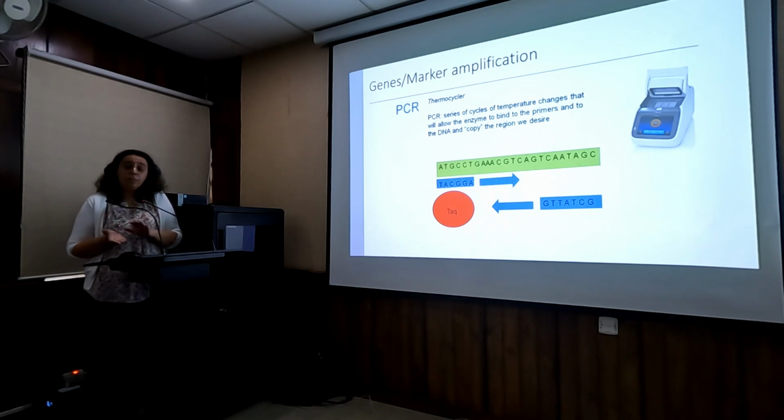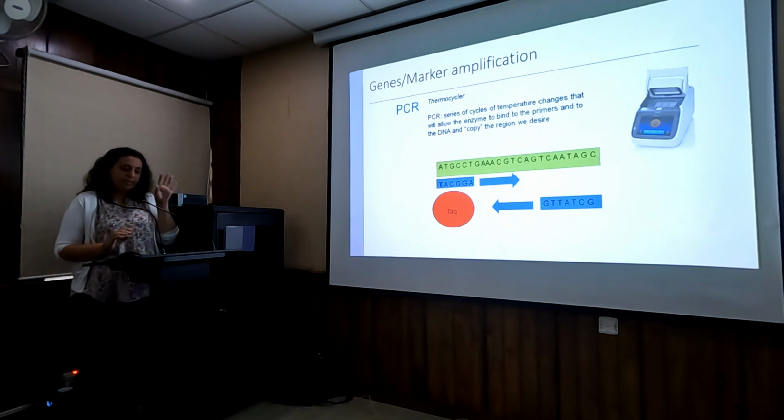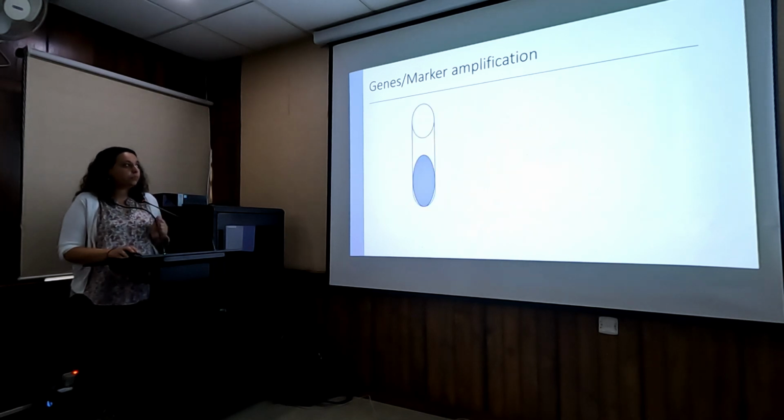And there's going to be temperatures that could be specific to some regions, so you have to be careful with that. Look at the literature. What was the temperature of annealing? What is the extension time of that? But that's what you use a PCR for, to copy just that region.